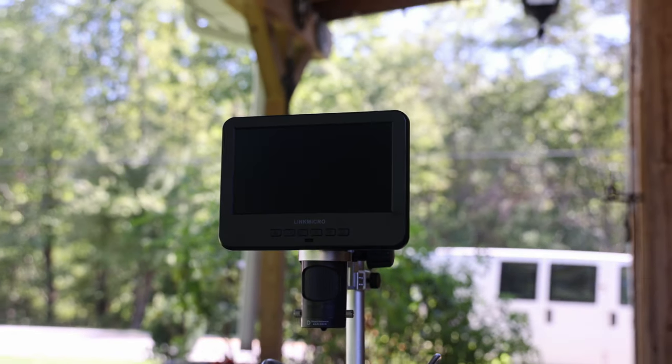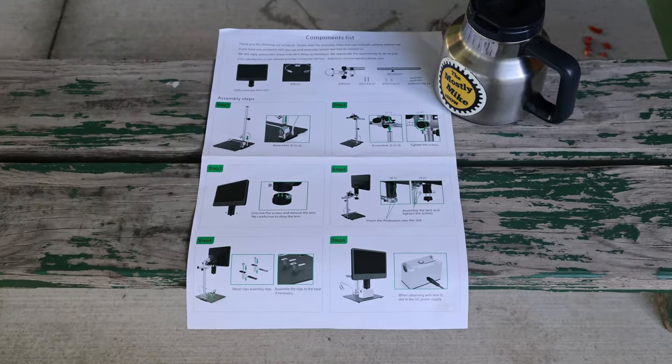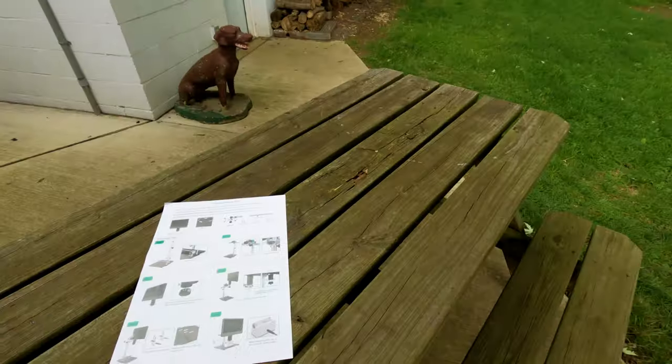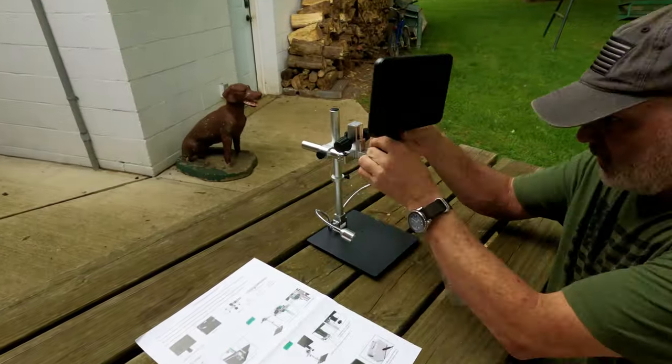I'm not going to waste a lot of your time with the assembly process. There's a well-illustrated, detailed one-page instruction showing you everything that you need to know about assembling this microscope. Here's the express assembly in Hyperlapse.